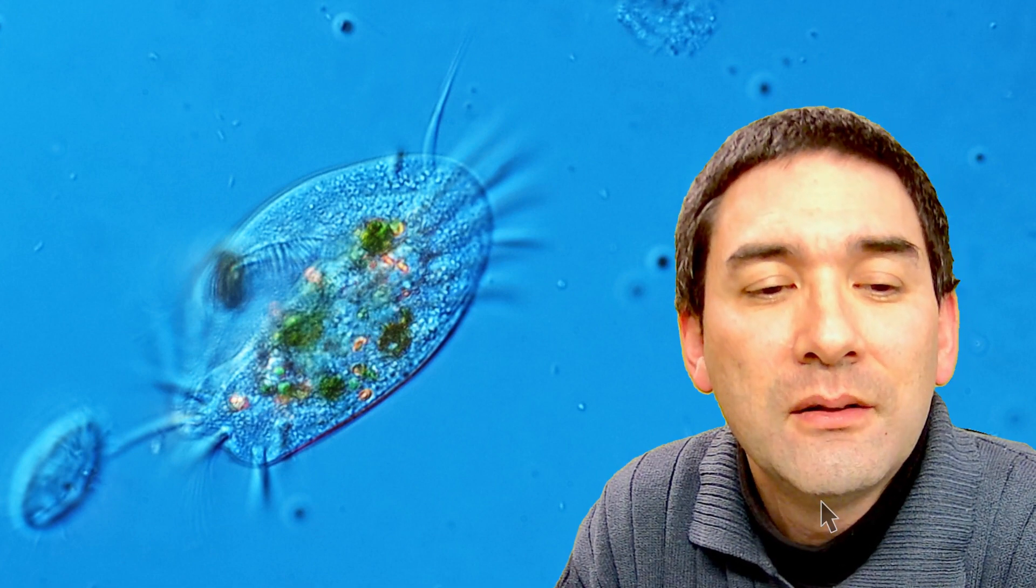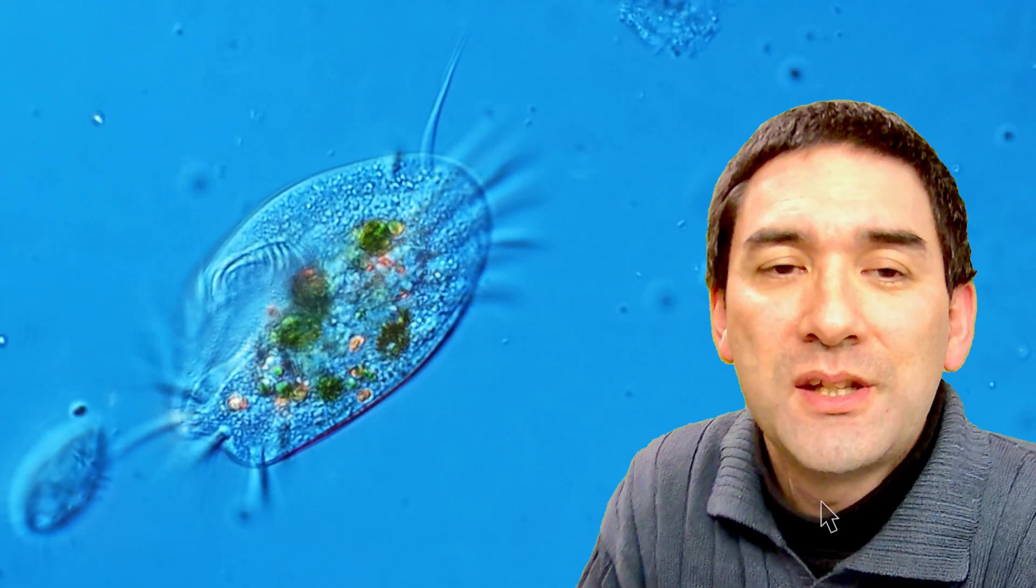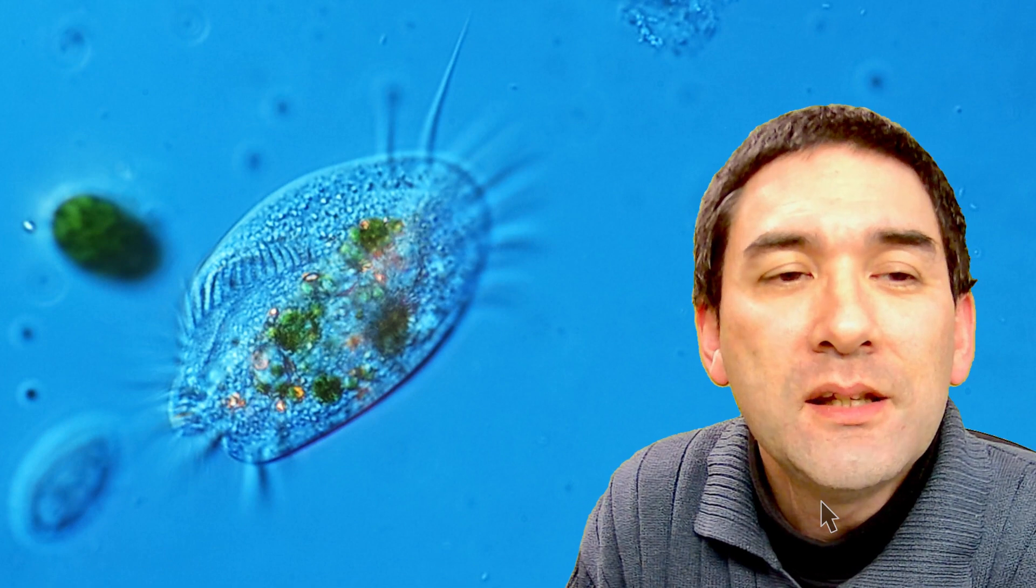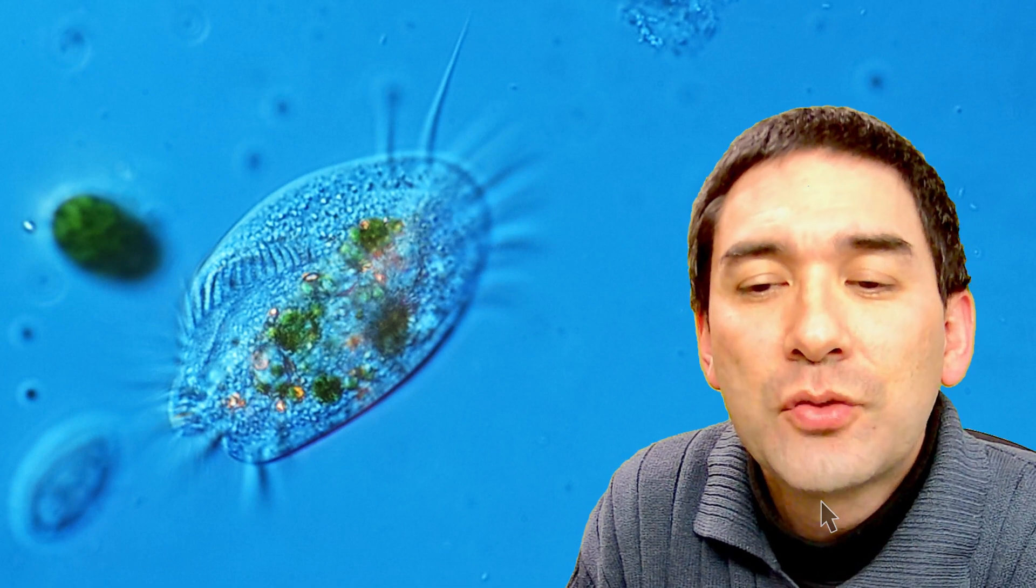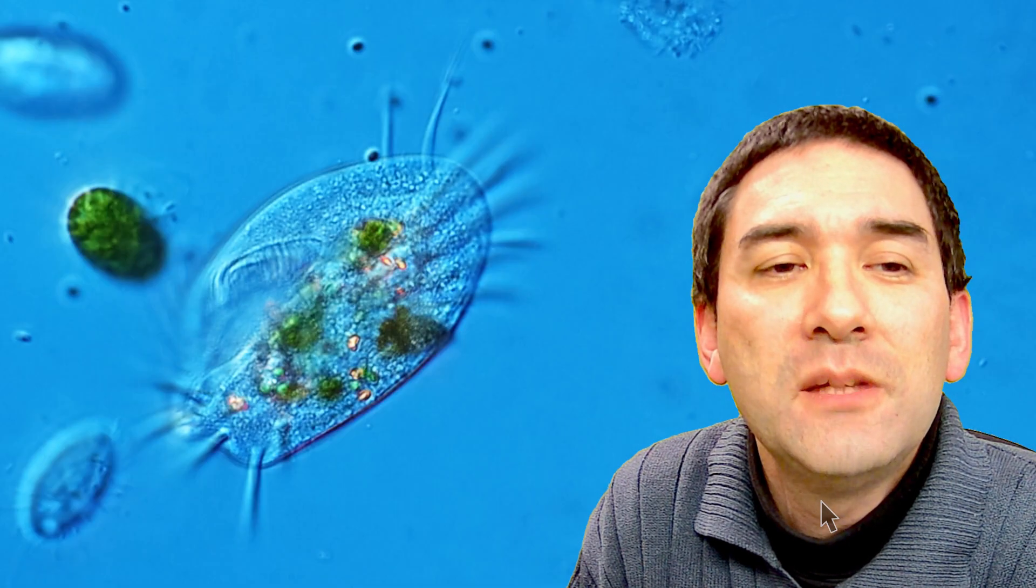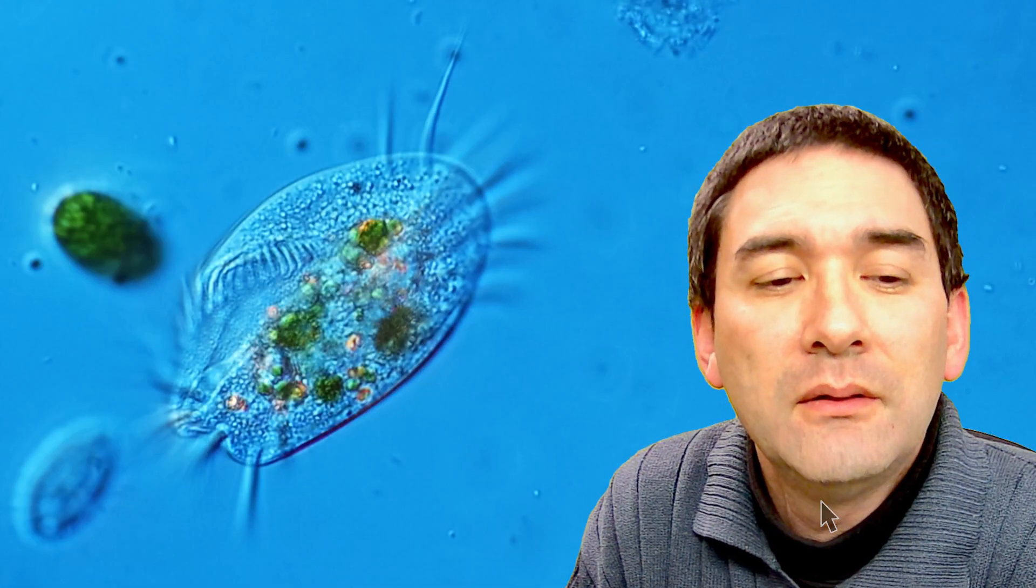Okay so you see it's quite interesting what you're able to see in a small drop of water. And the cilia of course also beating. And it's actually quite interesting over here. This green one unfortunately a little bit out of focus. Could this be a protozoan? Let me have a look.